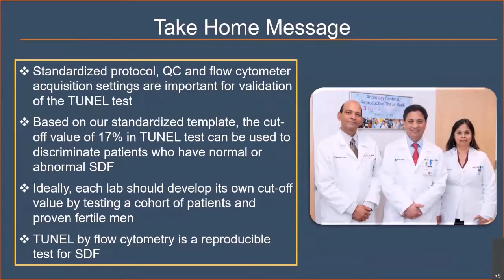So the take-home message for this test is that the standardized protocol, the quality control, and the flow cytometer settings are extremely important. The test should be validated before it can be used as a diagnostic test.